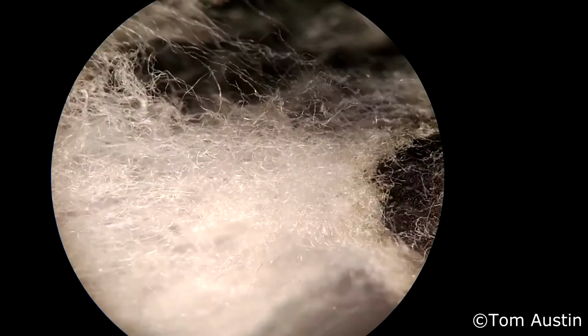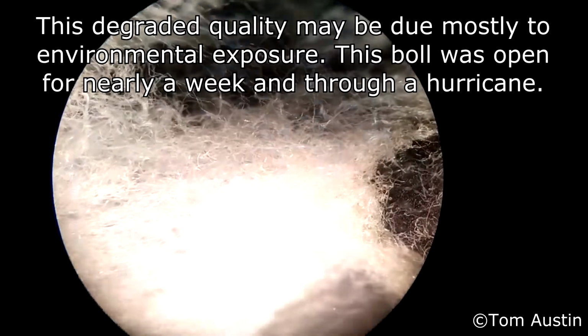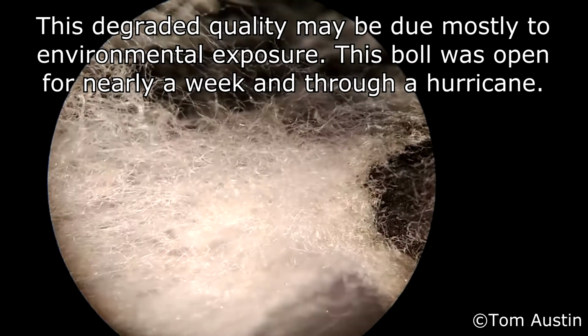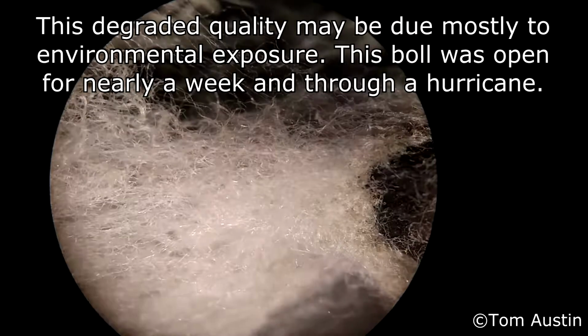It's just a lot of unevenness in the fiber quality, and that's definitely something we don't want to see. This also lends to why the cotton is just sort of breaking apart. It's just sort of ripping midway down the lint, and that is not conducive to making thread.